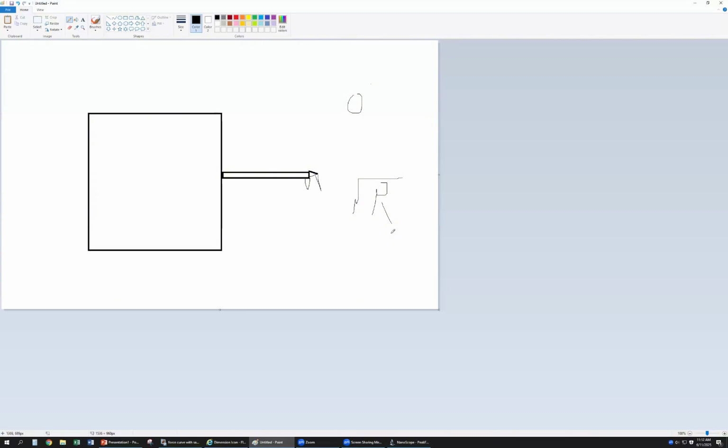So this one is calibrated by my factory. After they calibrate, they use the QR code to record that. For this kind of probe, they never calibrate, so you cannot see the code on the box. This one is cheap, this one is expensive. This one is cheaper. And also, inside this one there are 10, this one only 5.